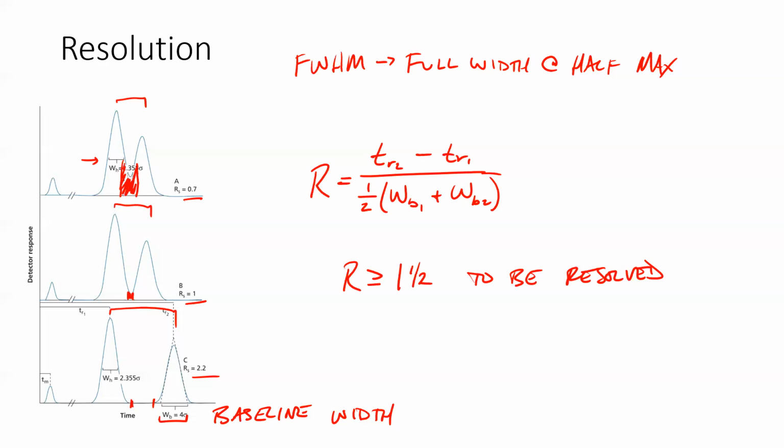And so that's sort of the balance between full separation, where we know that we get all A and all B and no mixture, but also balancing the fact that we don't want to spend a whole lot of time doing it. Okay.